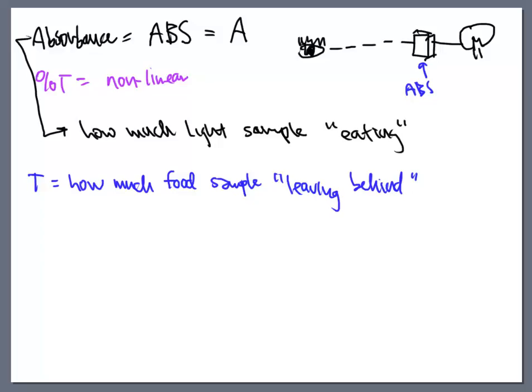Well, there's a relationship, right? There's a relationship with the buffet line. There's a relationship with the half empty, half full. There's a relationship with transmittance and absorbance. What is that relationship? Well, if I take the transmittance, whatever that transmittance value is, and I log that number and I put a negative out in front, that will allow me to calculate the absorbance value.